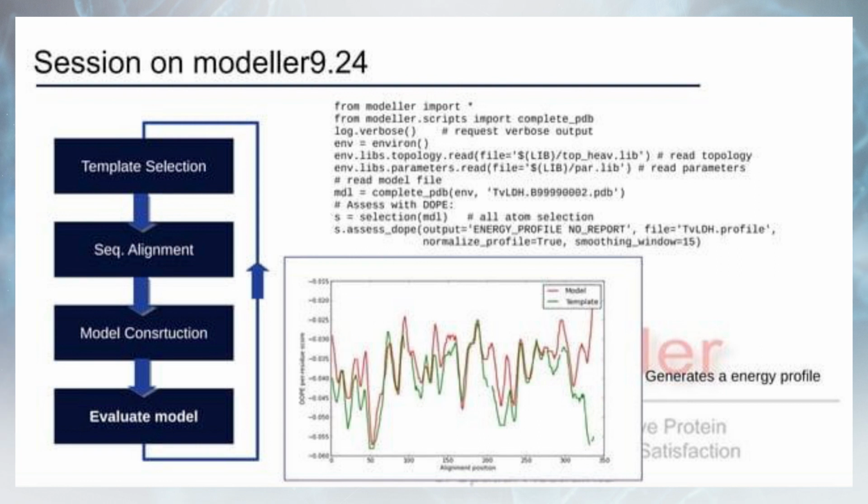We can see that in the middle portion a few deviations are there, otherwise the structure is almost aligned. But if you look at the far end, it has deviated a little. That portion needs to be refined more. If the structure is not perfectly fine, there are different methods to do that.